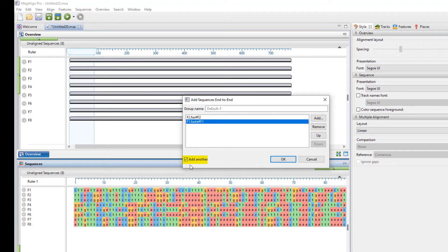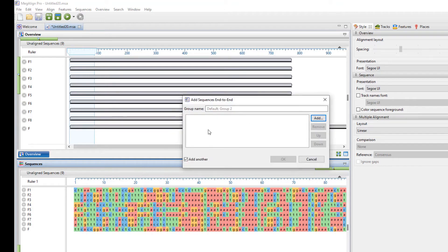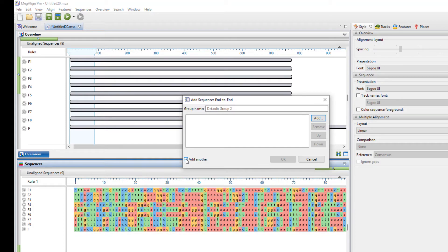And there's an option here. If I'm going to go through a series of these files, I can leave this checked and this will reproduce this window once the files have been created. If you don't want to use any more, you can click it off here. Or alternatively, you can check that box and it won't produce additional windows.